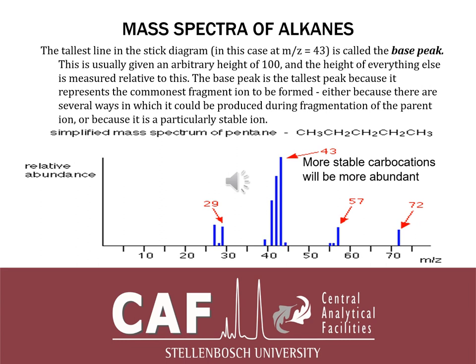So what happens is that if you lose CH3 and CH2, what's left from the CH3, CH2, and CH2, the positive ion will be at that CH2 plus from the CH3. So there are more than two, three carbons where the carbocation can be stable. The positive ion can be stabilized and rearranged. That is why that's where the highest peak will be coming from in that molecule, because of the stability, because of more places where the positive ion can be stabilized. That's why they call it a carbocation.